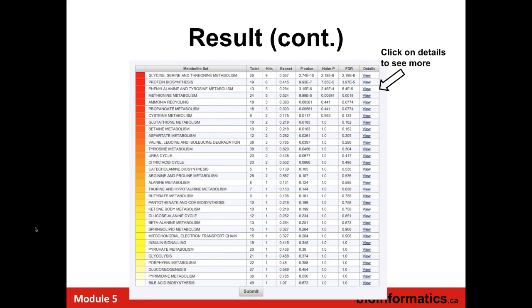The expected value, I think that's calculated the same way that BLAST values are done, but Jeff might be able to give you an idea. I don't use that. I just use the FDR, and I think that's obviously the more relevant.